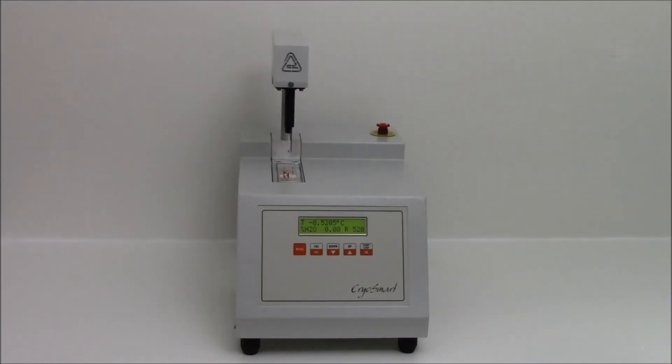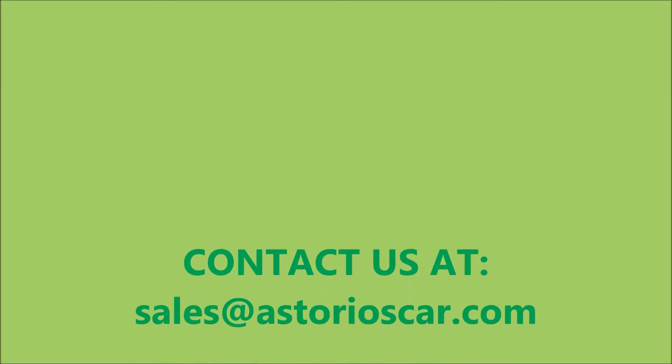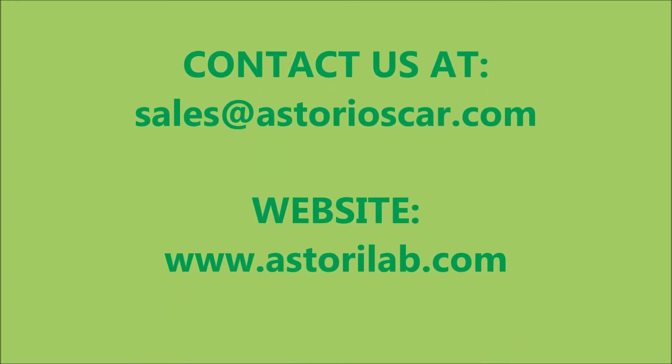At the end of the analysis, the head will automatically rise up. For more information, contact us at sales@astorioscar.com.